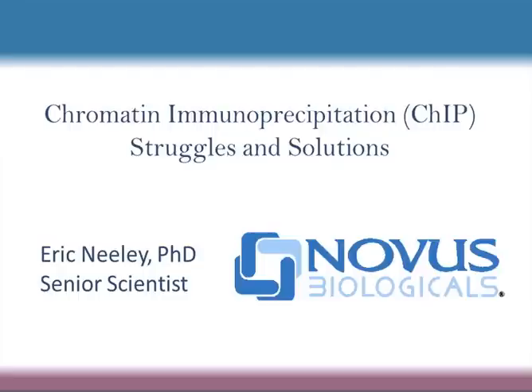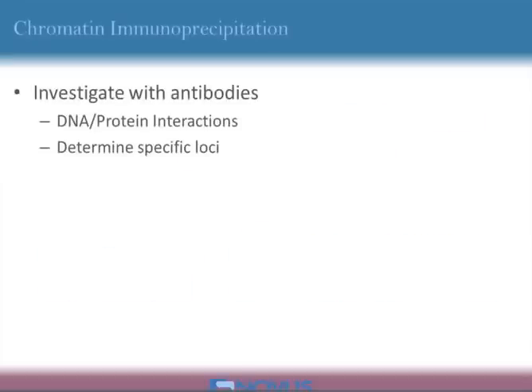Thank you very much, Nick, and thanks everyone for joining us today. As Nick said, today I'm going to be talking about chromatin immunoprecipitation, or ChIP, and I'm not going to go through all the specific details of the ChIP protocol, but instead I'm going to focus on the problems that occur either when starting ChIP or ways to optimize your ChIP assay if you've been doing ChIP for a while.